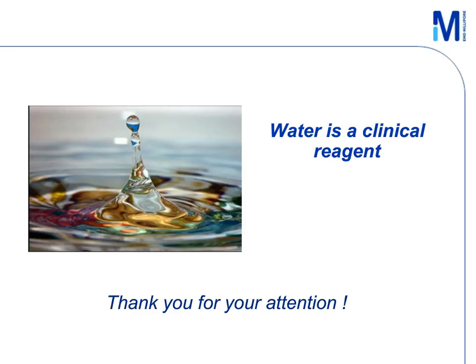Great, thank you. Now, Sean, do the water purification units require any sort of sanitization? All of our systems are sanitized at start during installation, so that comes standard with the system as we do a startup sanitization. After that, it's not necessarily required, but it's recommended that the systems be sanitized on an annual basis, just to prevent, you might have a very small colony of bacteria somewhere within the system that you might not necessarily be picking up in any of your micro counts. So if it goes unnoticed, it could present a problem down the road.